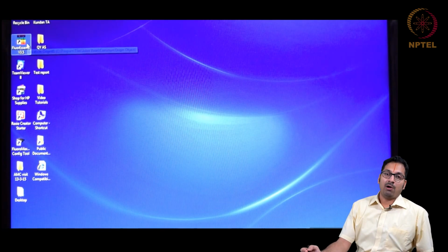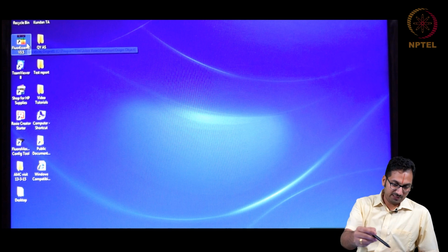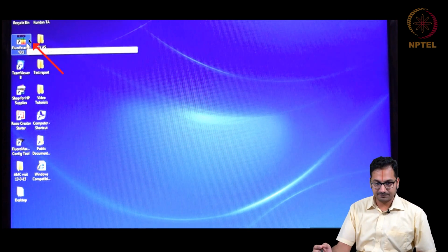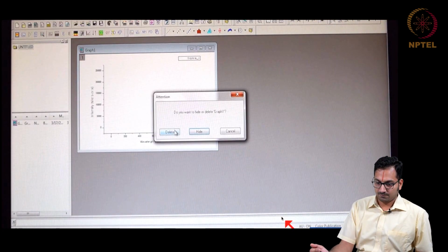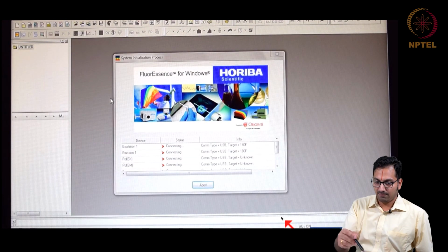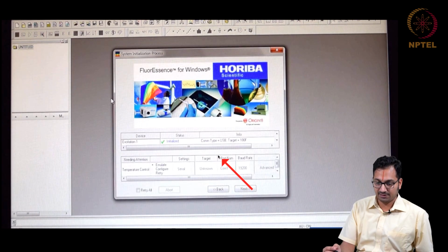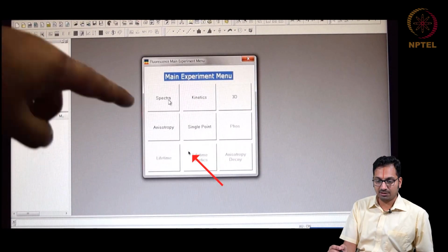As always, with modern equipment, you would end up recording the data using a computer. Here we are just trying to show the software which we end up using in order to make a measurement. So you start the manual initialization process such that all the parameters can be carefully set. So once the initialization comes up, then you are all ready to start your measurement.